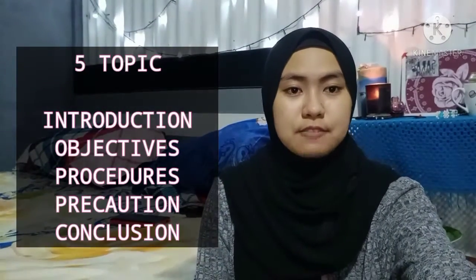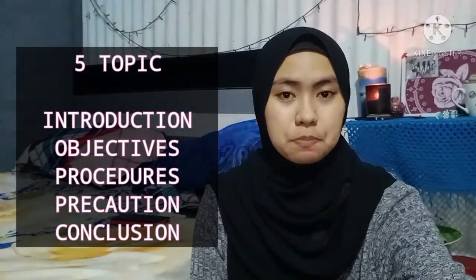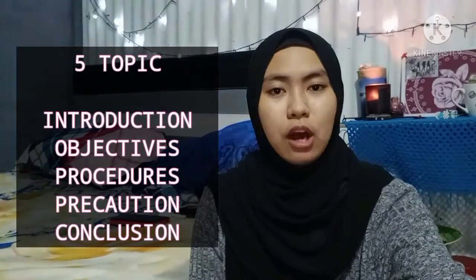Second is the objectives. Third is the procedures, where I will talk about the steps involved in this aseptic technique experiment. Fourth is the precaution to make sure that we can minimize the possible error that can affect the results. And lastly, the conclusion, where I will discuss the overall overview of these procedures.